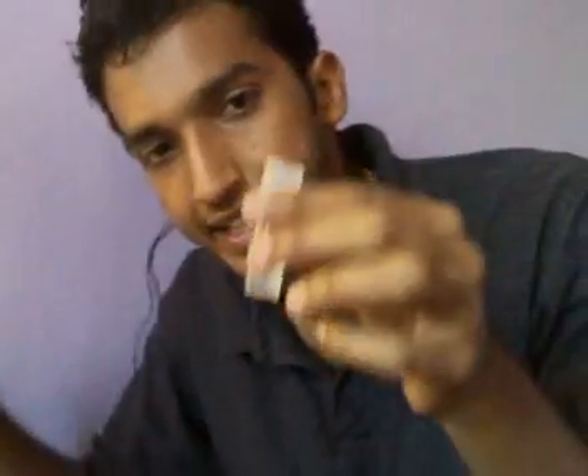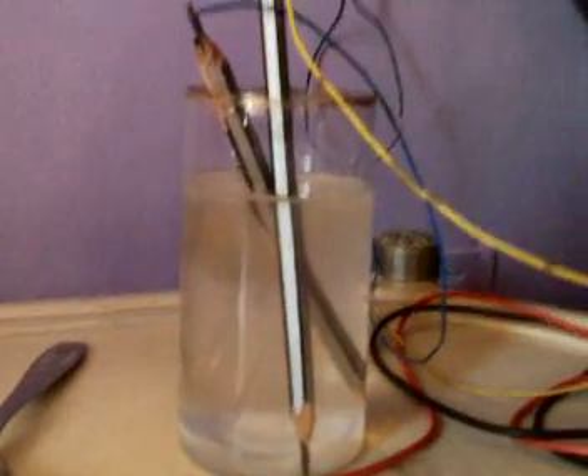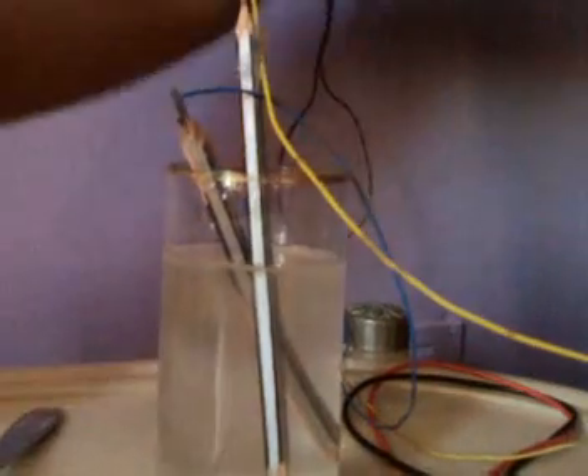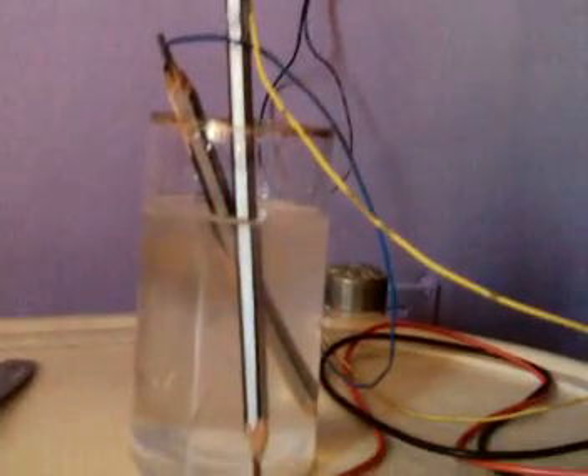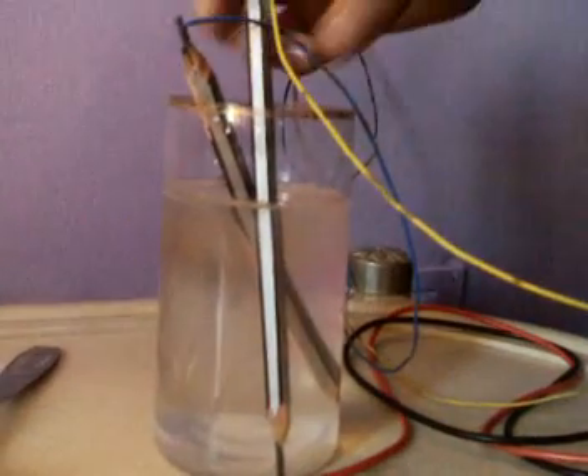Now add phenolphthalein — this acts as an indicator. Just add two drops of phenolphthalein indicator. You can see that there is no color developed in the salt solution yet.